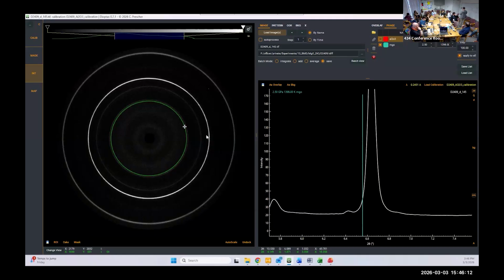And then what we want to do is fit this ellipse. The ones in here are intermediate. They're not perfectly aligned with the maximum compressive direction, but they're not 90 degrees to it either. Fitting this ellipse will tell us what the differential stress is in our experiment.